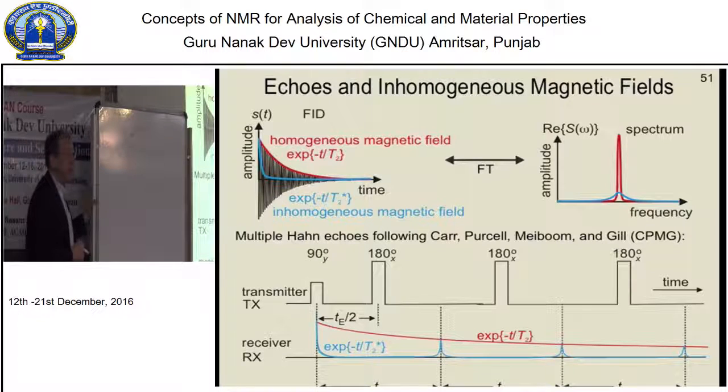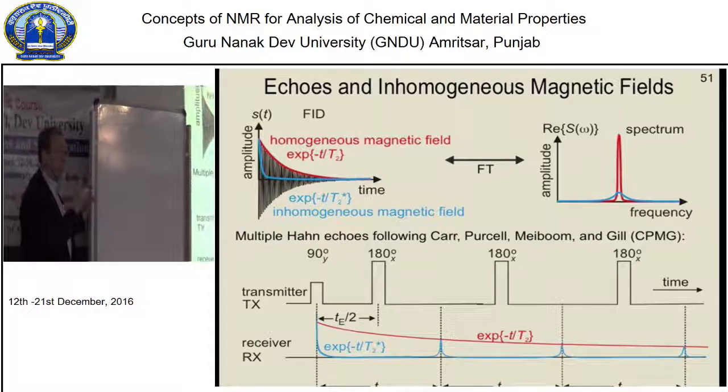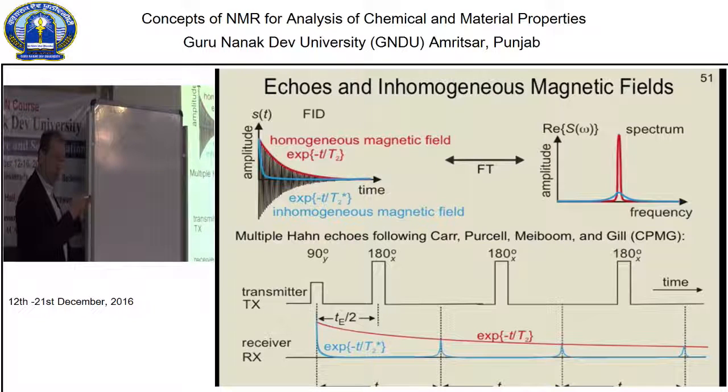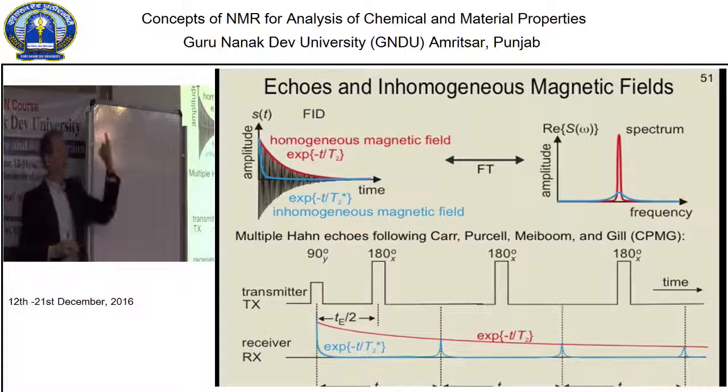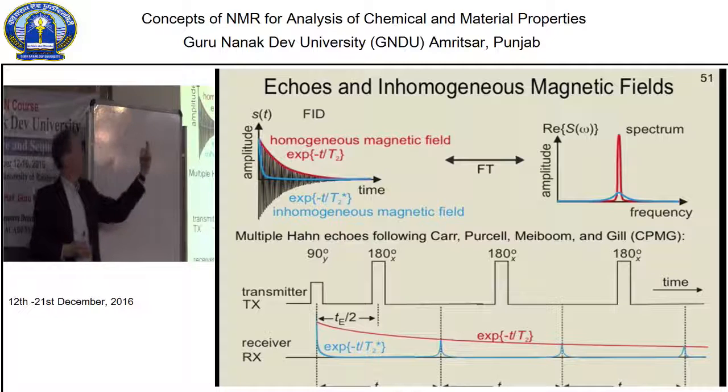Now you want to couple with a magnetic field. You want to interact with that magnet by bringing in an oscillating field. So that oscillating field should sort of follow that rotation in the plane perpendicular to the z direction. So it also has to do this motion along with it. If it does it in the opposite direction, it's out of resonance. You want to move along with the magnetization to couple to it.